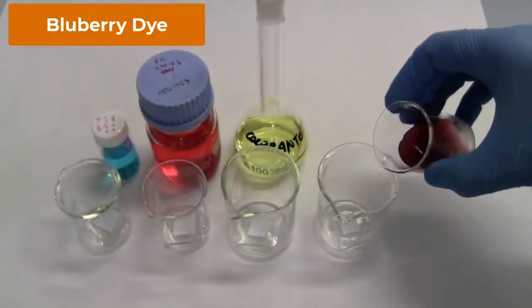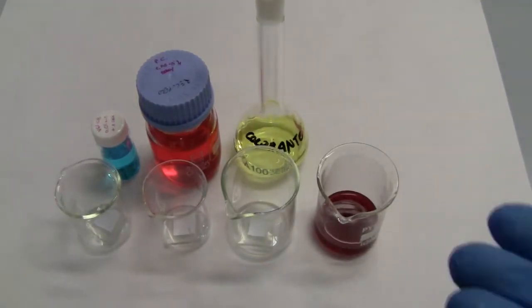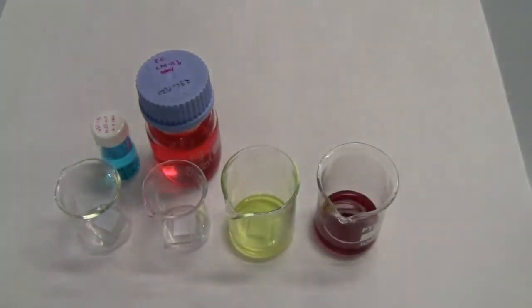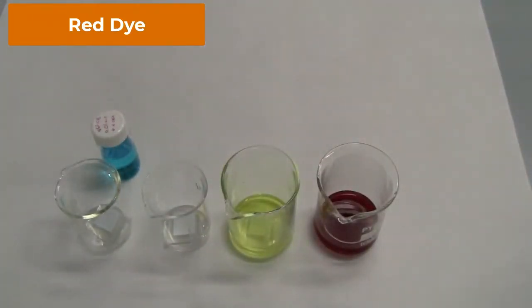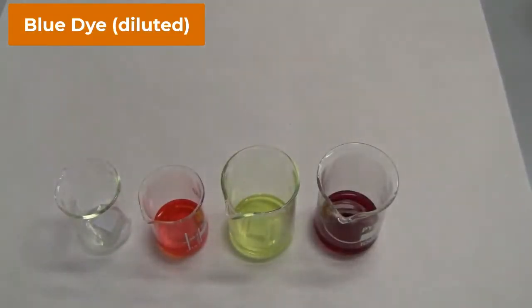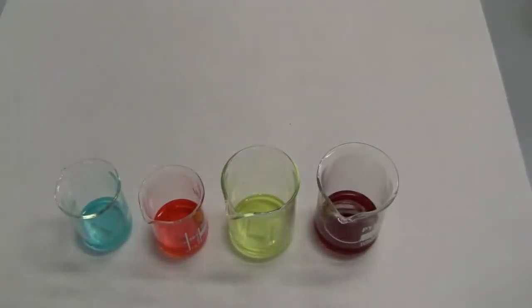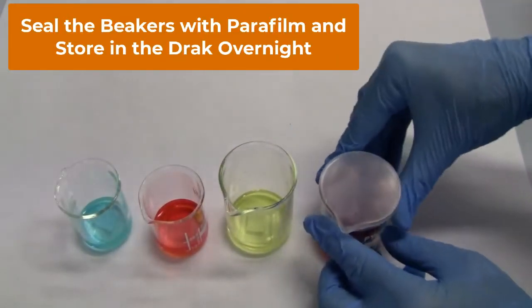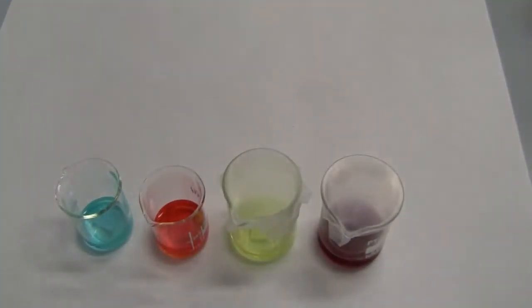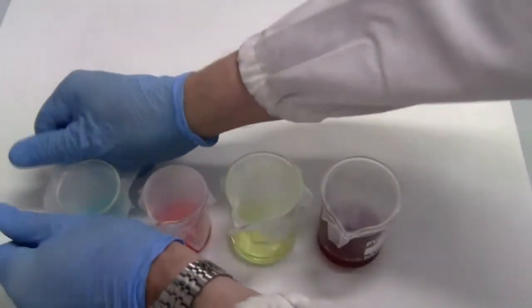Now we will dip every glass with a specific dye, the blueberry, the yellow one, merocyanin, the red dye, which is a dye from our research lab, and after also another dye from our lab, which is a blue, it's a squaraine, but added with some anti-aggregating compound. Since we are working with ethanol solution or water solution, we cover all these beakers with the parafilm, with a sheet to avoid evaporation. We store them in the dark.